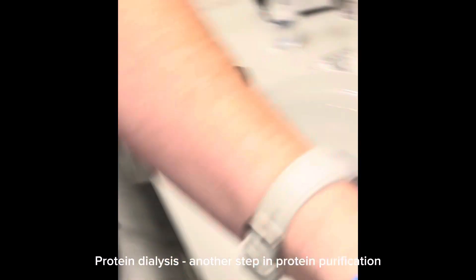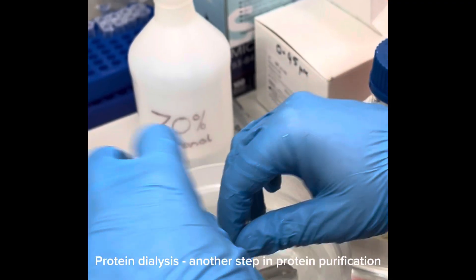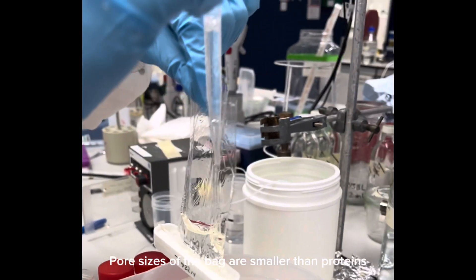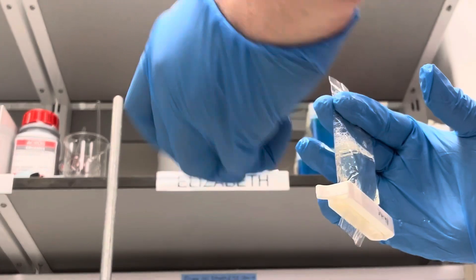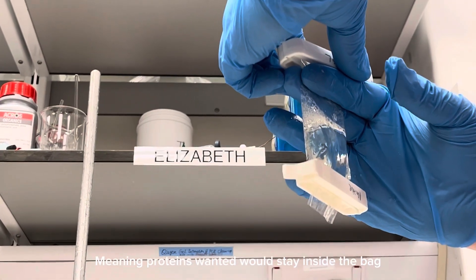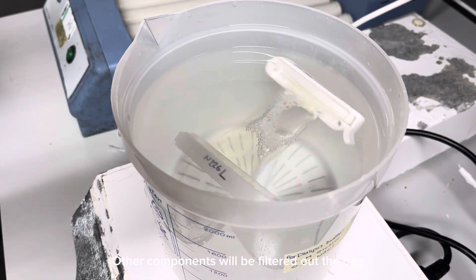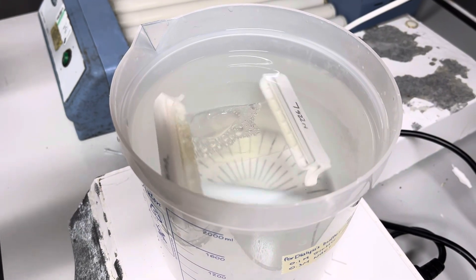This is protein dialysis, which is another round of protein purification. The pore sizes of the bag are a lot smaller than the proteins, which means the protein will stay inside the bag while other components that we don't want will be filtered out.